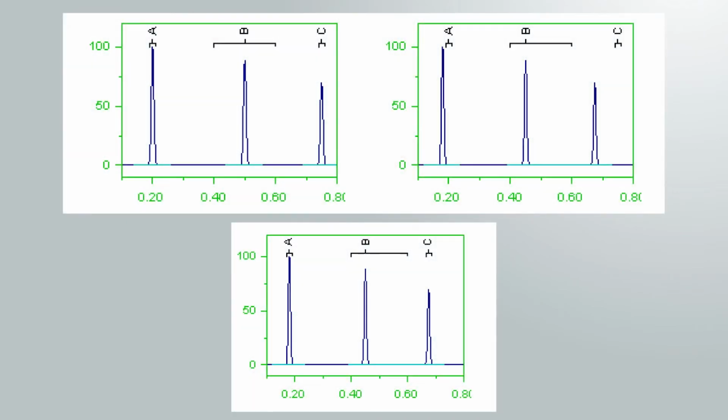Typically, one component is declared the retention time reference component. This component should elute in the same general part of the chromatogram as the components that will use it as a reference, ideally in a region free of other peaks. If other peaks are present, they must be significantly less than the candidate reference peak.